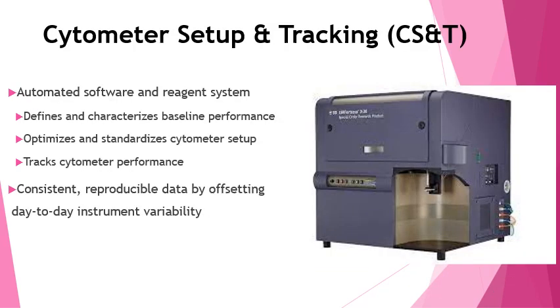One of your daily controls that you're going to do is your cytometer setup and tracking, and this is called CS&T. This is an automated software and reagent system, and it defines and characterizes the baseline performance of the instrument.